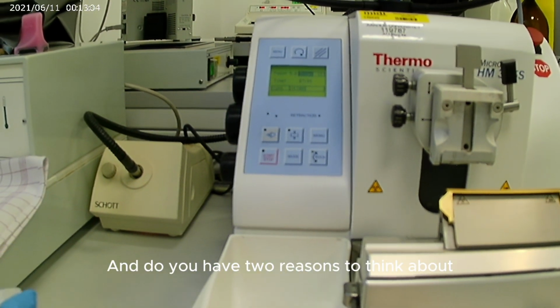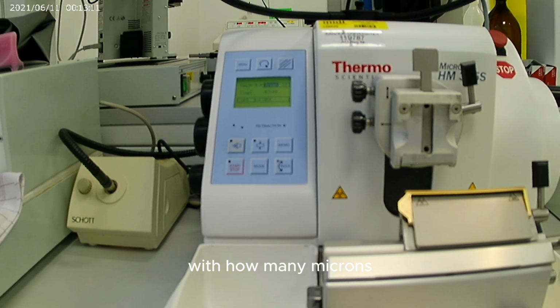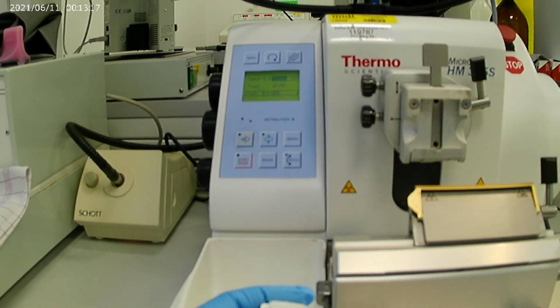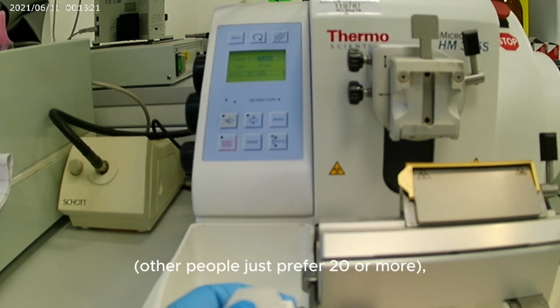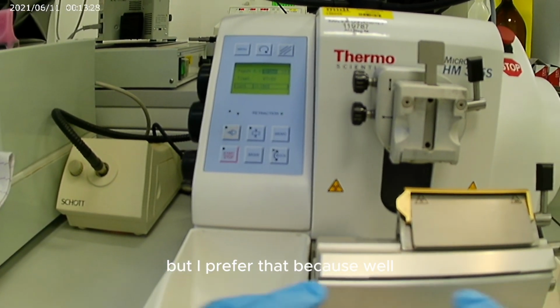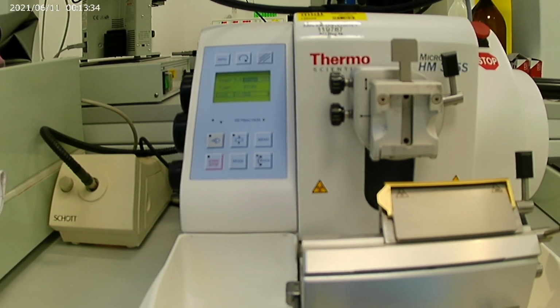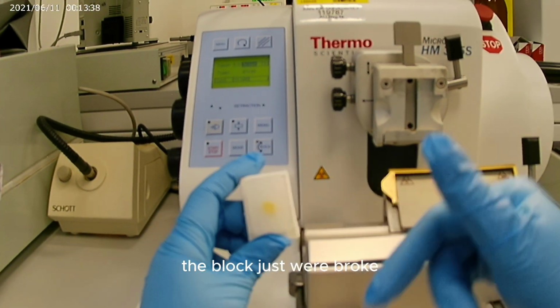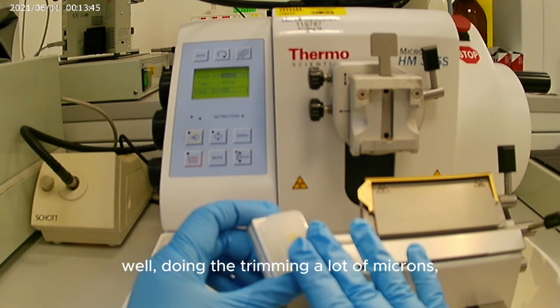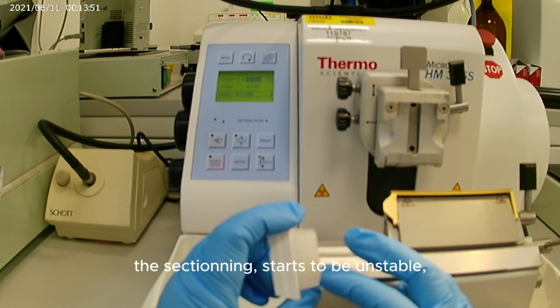And you have two reasons to think about how many microns you are going to use for the trimming. I'm doing the trimming at 10 microns, and I know it's not a lot. Other people prefer 20 or more, but I prefer that because it happened to me once that the block broke. When you are trimming at a lot of microns, the sectioning starts to be unstable.